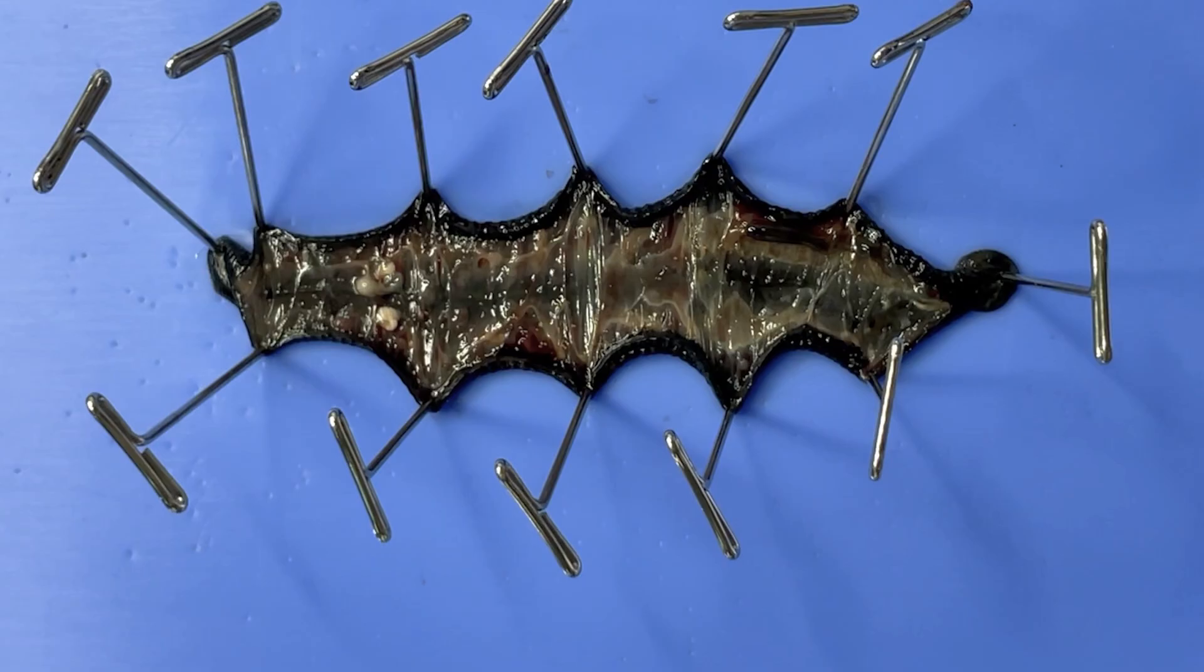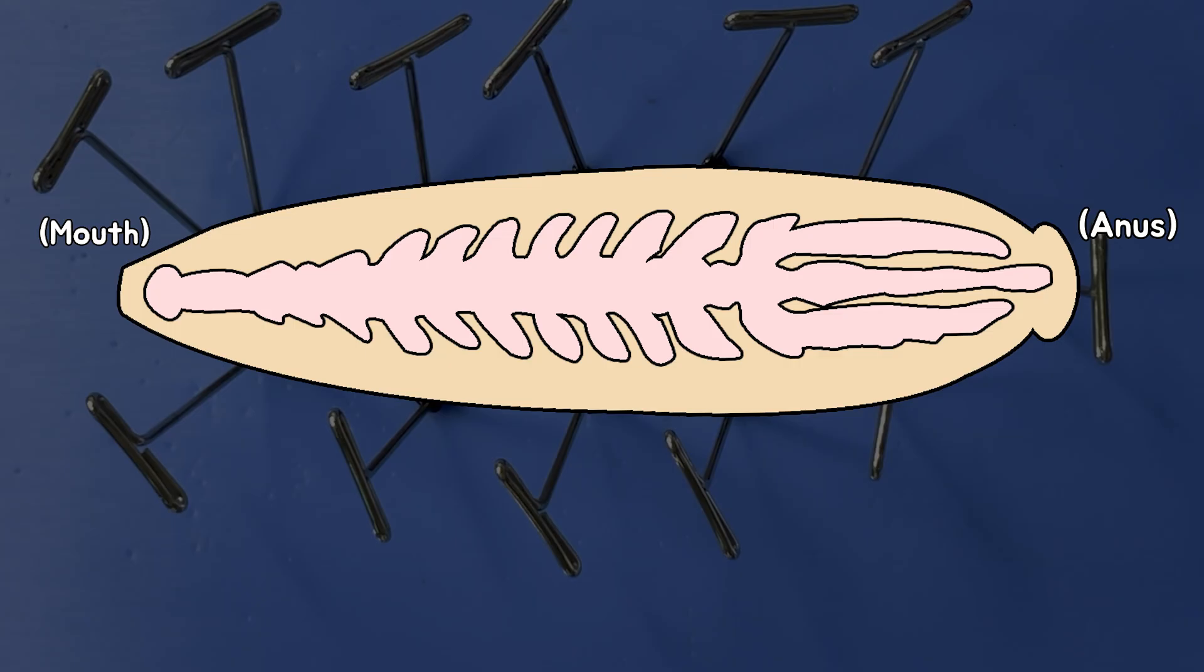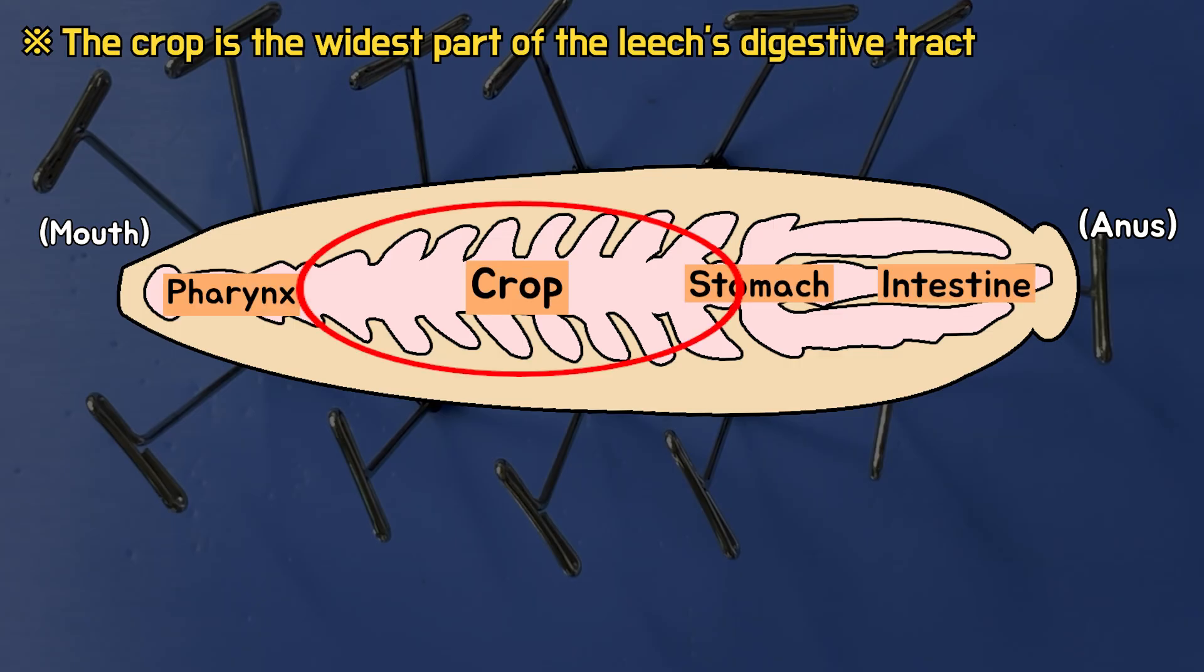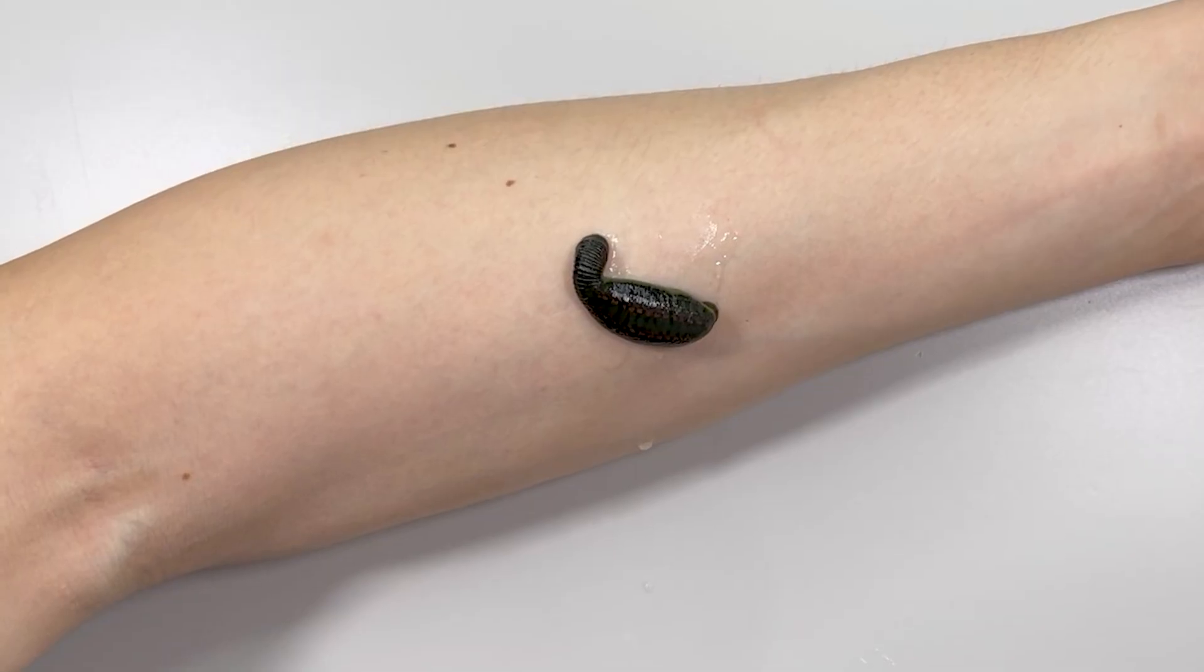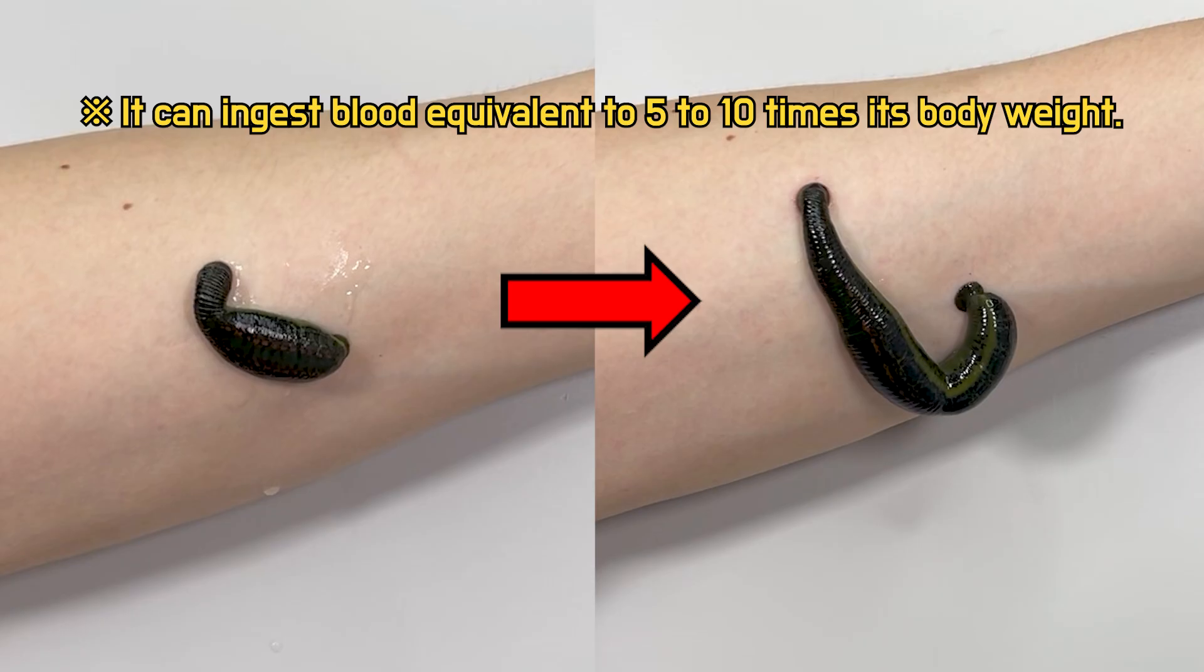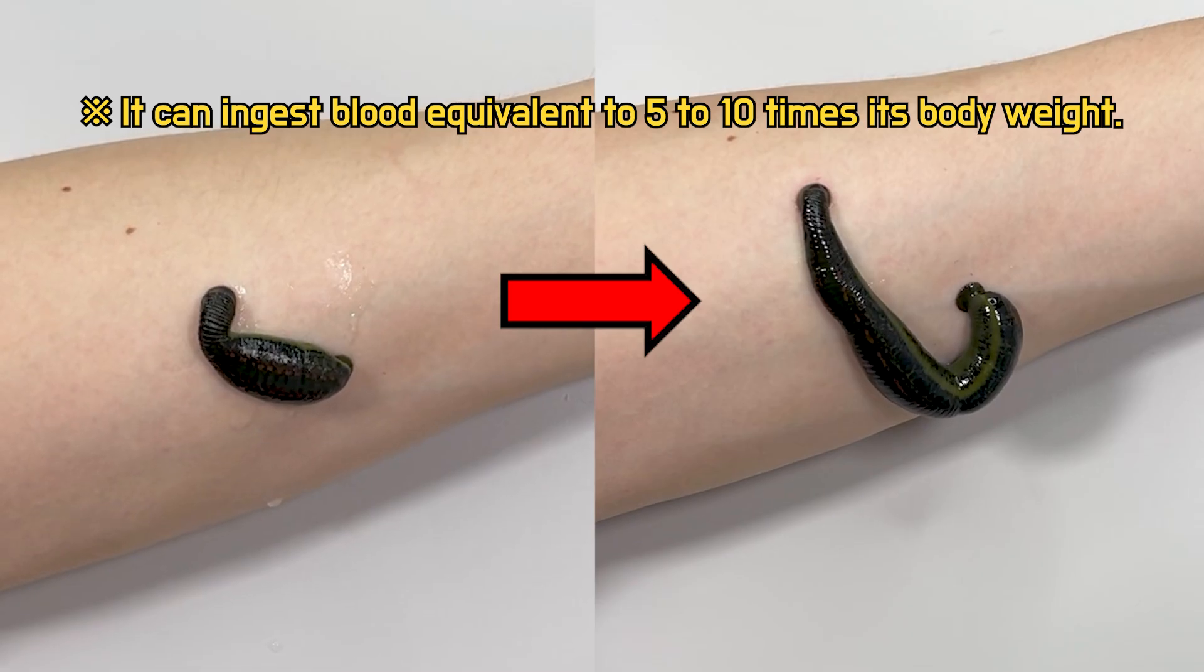Next, their digestive tract runs straight from the mouth to the anus. The crop is the part where food is temporarily stored. The leech's crop has great elasticity, allowing it to consume a large amount of blood at once.